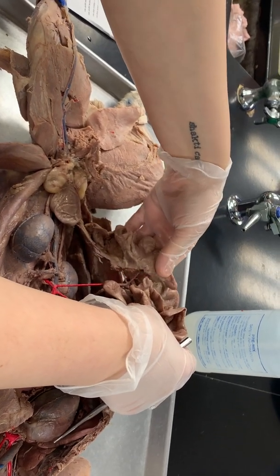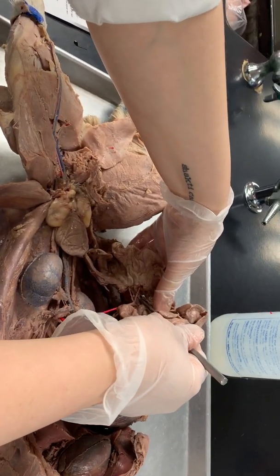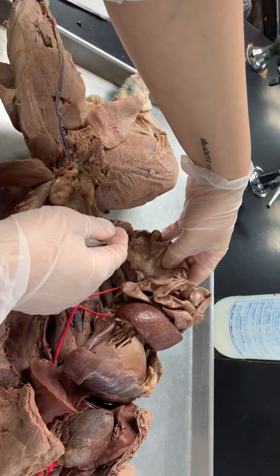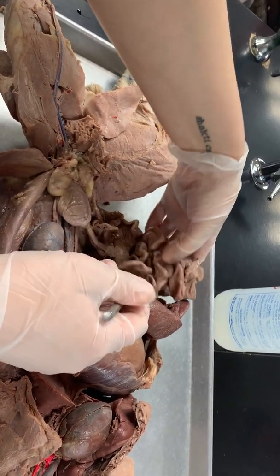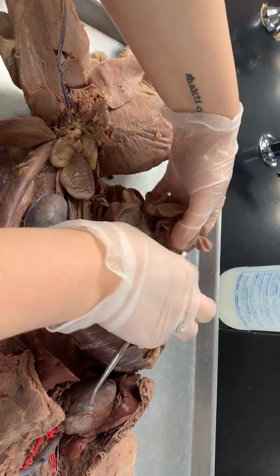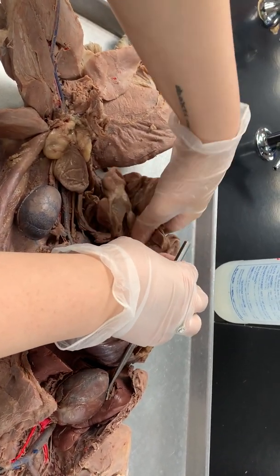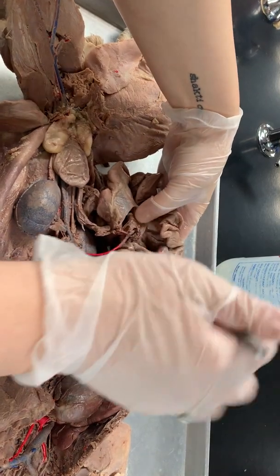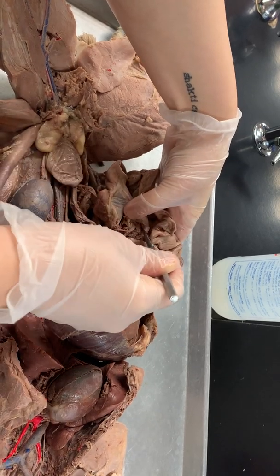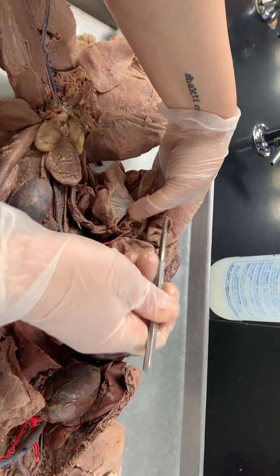That's your ileocecal junction. And you can see right here, this is your ileocolic artery. This is your middle colic artery, which goes to the middle of your large colon, very flat, right? And then your intestinal artery is the artery that goes to, it's this one. And if you cleaned it a little bit, you'd see it kind of fanning out to serve the whole of the small intestine. Okay.